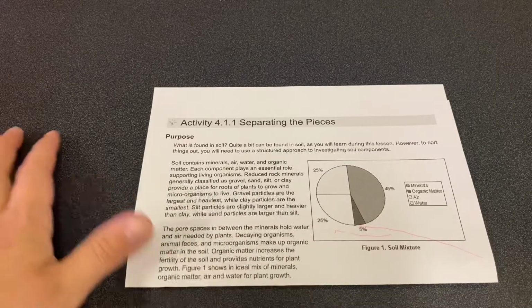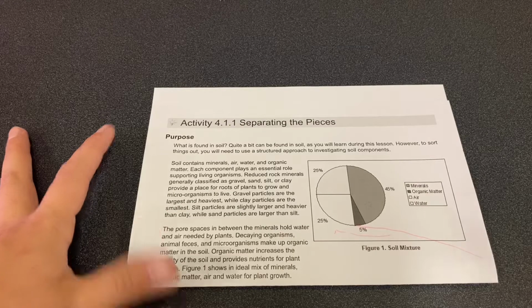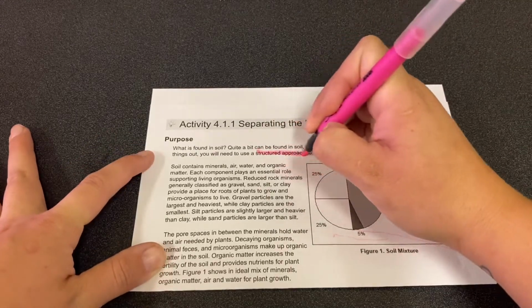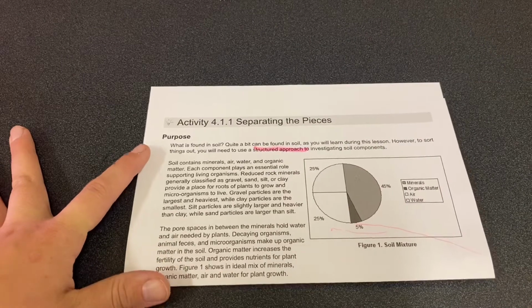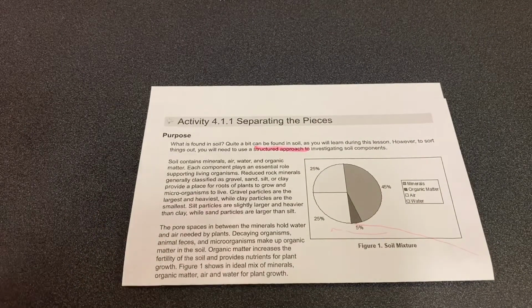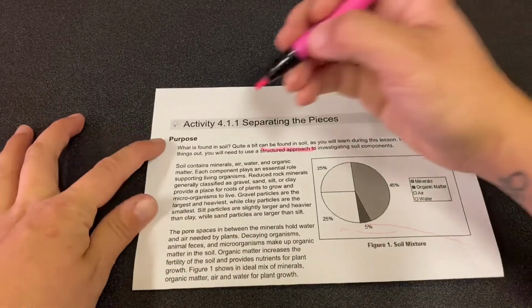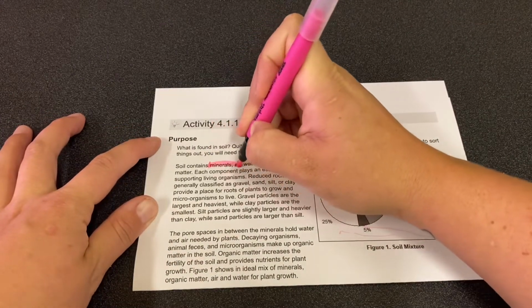Quite a bit can be found in soil, as you will learn during this lesson. However, to sort things out, you will need to use a structured approach to investigating soil components. It's already soil. If we want to know what's in it, we have to do a very structured lab to break it apart.